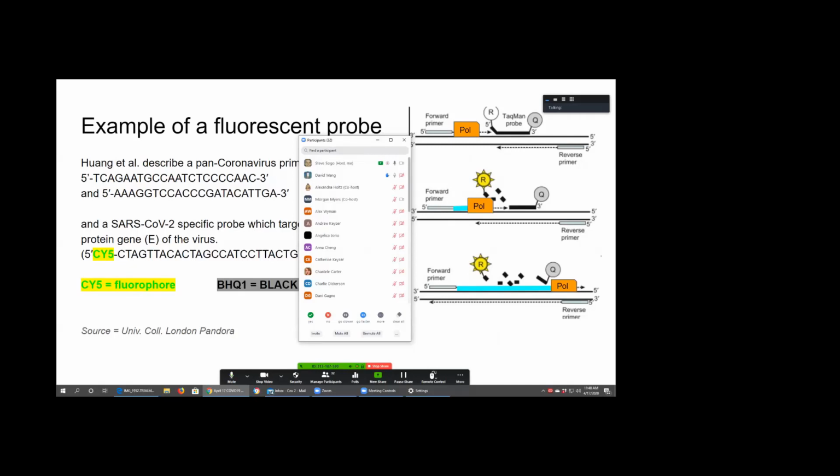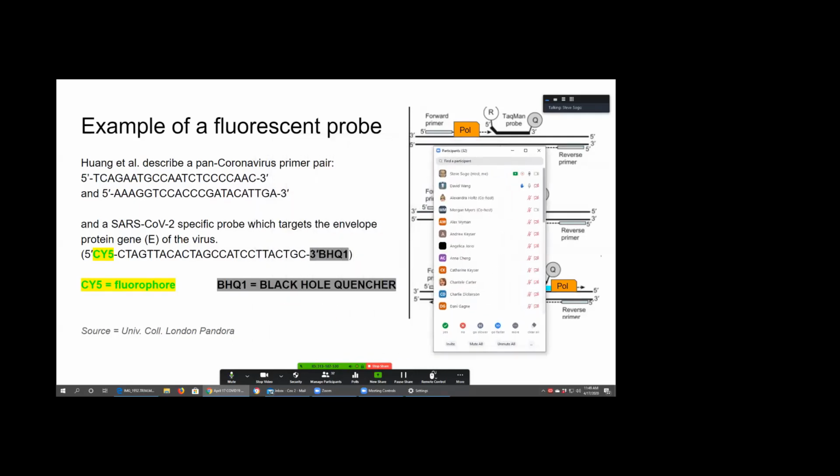Okay. It's on a slide that comes later, but the primers you order. There is a company called Integrated DNA Technologies, IDT, and that's their whole job, is to make sequences of DNA for people who want to do this kind of work. So they can make this probably overnight. We used IDT to make Raoul's primers, and it was amazing. I was so surprised. It's like, here's your 20 nucleotide sequence.